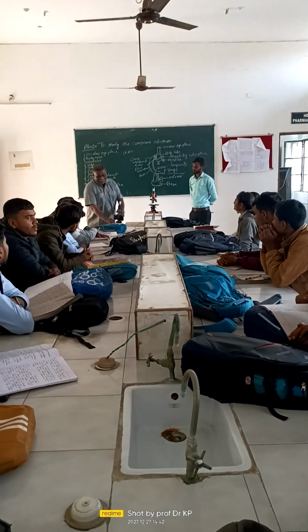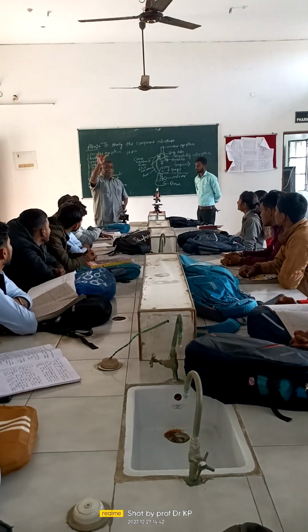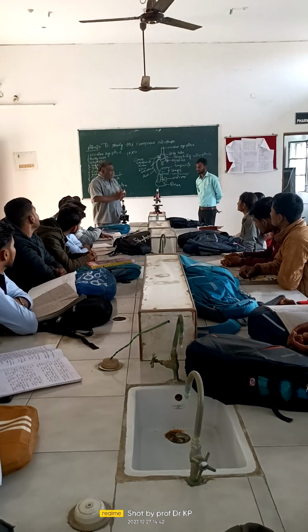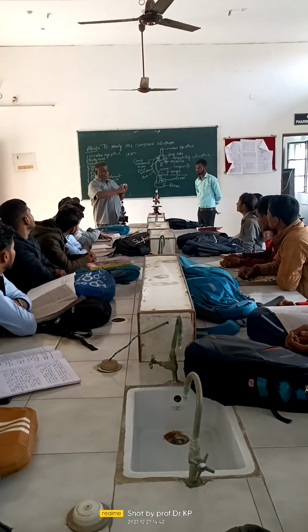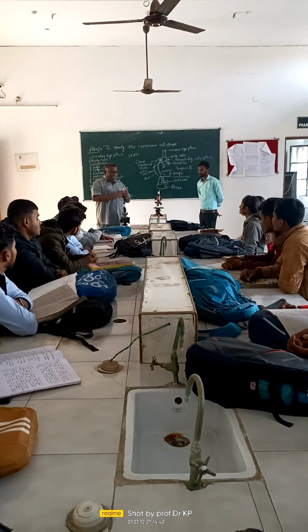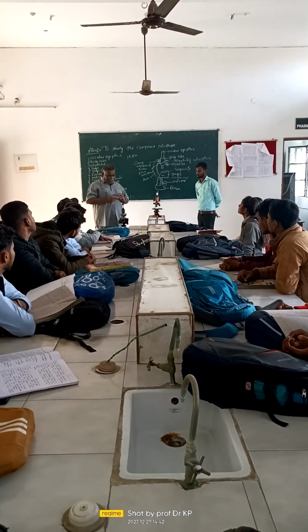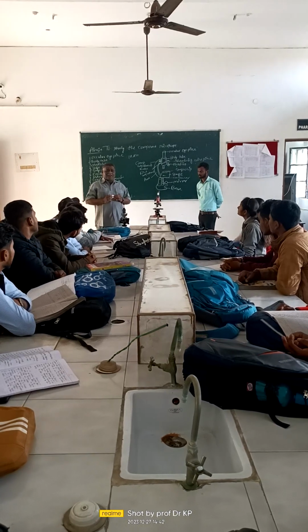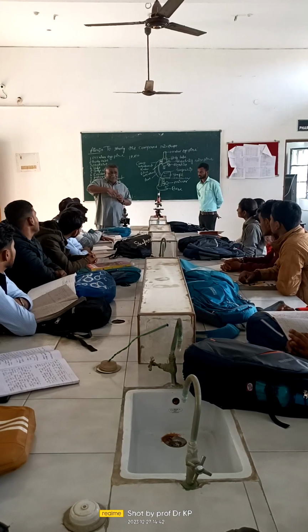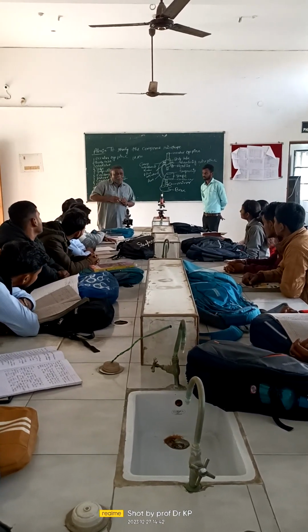Right? Below that, there is an optical part called a mirror. The mirror has two surfaces. One is a planar surface. The other one is concave. So you may be knowing science. Planar will be capable of taking light and reflecting it all, but the concave mirror is capable of taking light from different directions and getting it piled over at one place, and will give more amount of light.